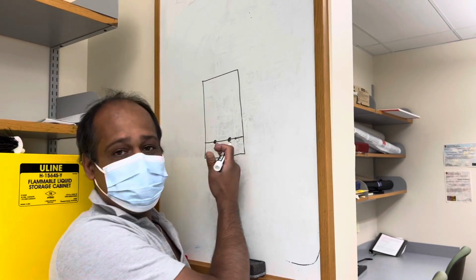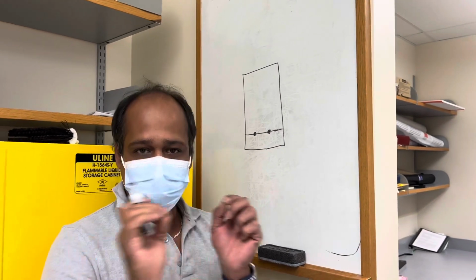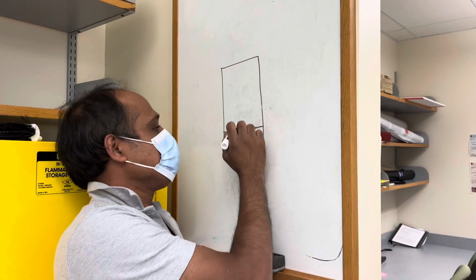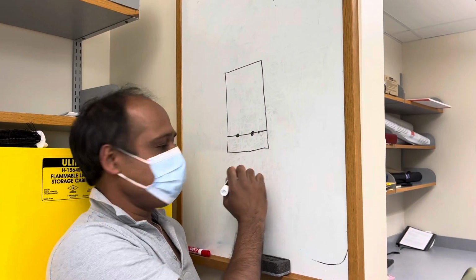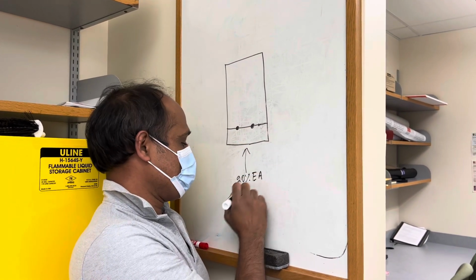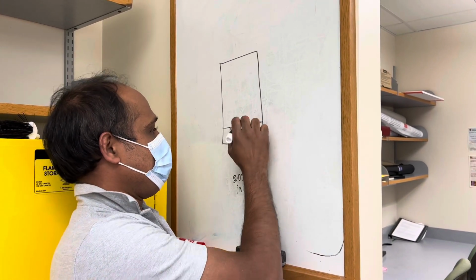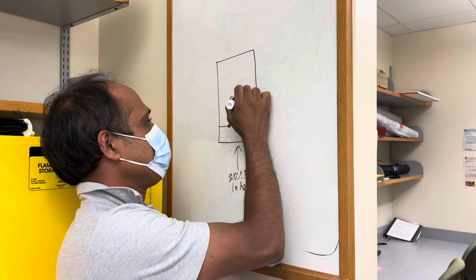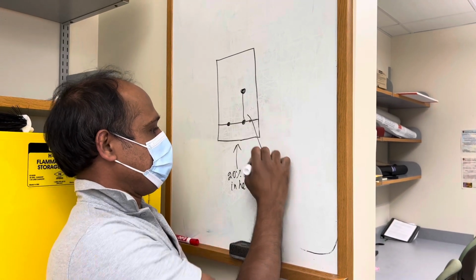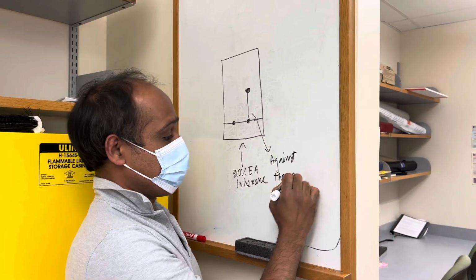Okay, suppose you have this TLC plate. You know already TLC, like thin layer chromatography, right? So thin layer on a glass plate on the silica. So you spotted your compound here and you run the solvent. So like 20% ethyl acetate in hexane, according to you. Okay, so this crude is moving, and suppose your crude was here, and this thing is happening against the gravity, okay, against the gravity.